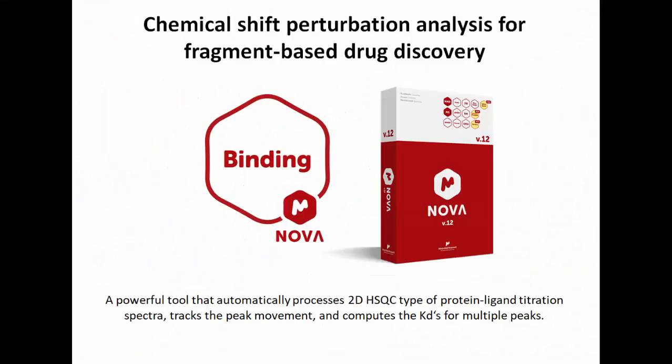MNOVA binding. In this video I will show you briefly how to use MNOVA binding to analyze a series of protein-ligand binding titration spectra interactively.